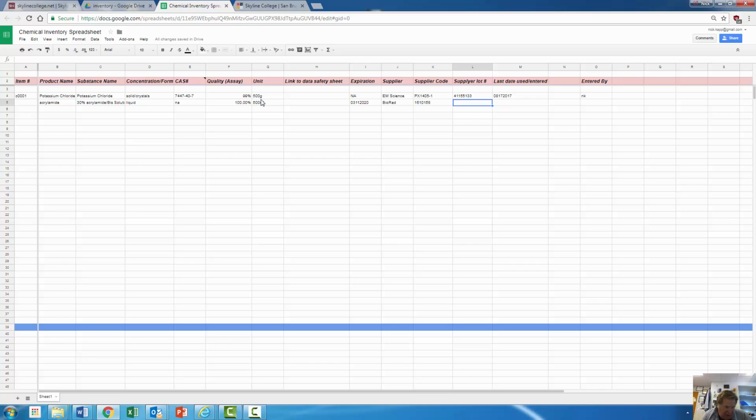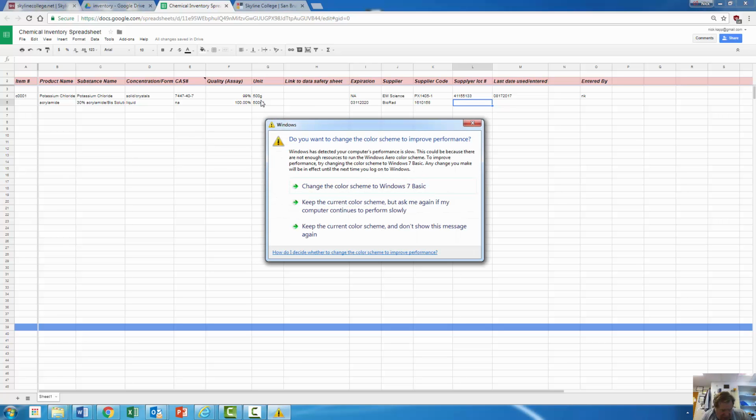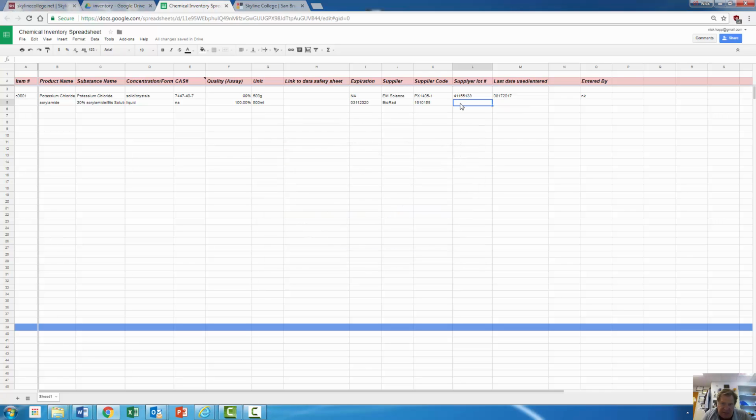Supplier lot number, and so all these things are going to have a unique lot number. Peel here. It's a little bit harder to find the lot number, or in this case the lot number is the same as the control number, which would be 64097-207. Date entered is 08-17-2017 and put in by NK. All right, and so this should be it. Thank you.